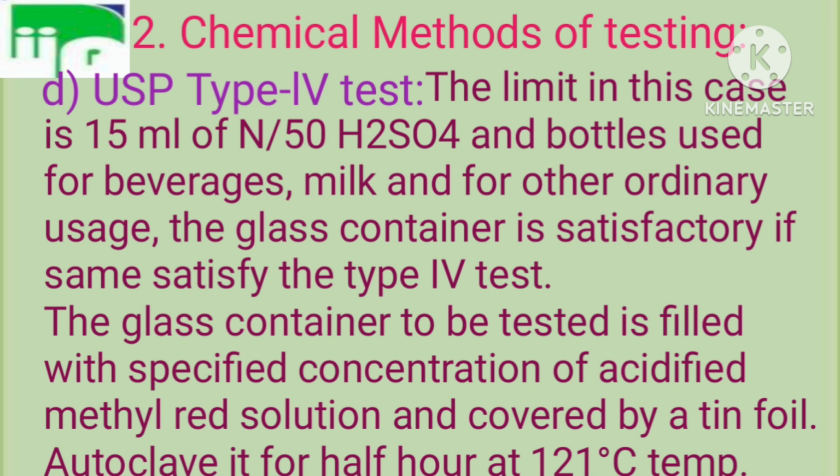The glass container is satisfactory if it satisfies the type 4 test. The glass container to be tested is filled with specified concentration of acidified methyl red solution and covered by a tin foil. Autoclave it for half an hour at 121 degrees centigrade temperature.